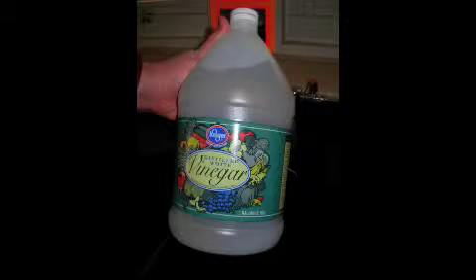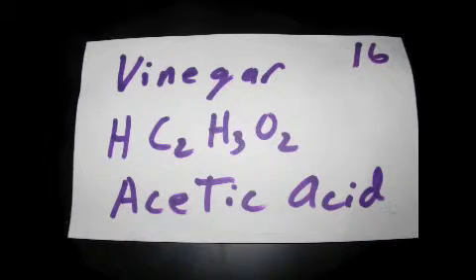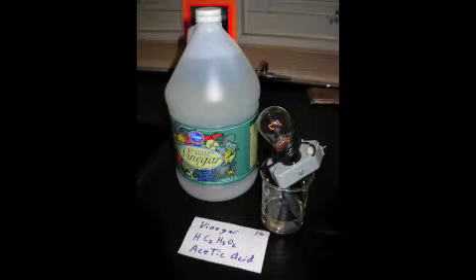Our next sample is going to be distilled white vinegar. Formula for this is HC2H3O2. As you can see, none of those are metals, so we will assume that the light bulb does not light up. However, we see that once we place it in the solution, there is a small amount of illumination coming from the light bulb. This is a covalent bond, however, it's not completely distilled water, so once again, there's calcium carbonate most likely present in it, causing a slight amount of illumination.